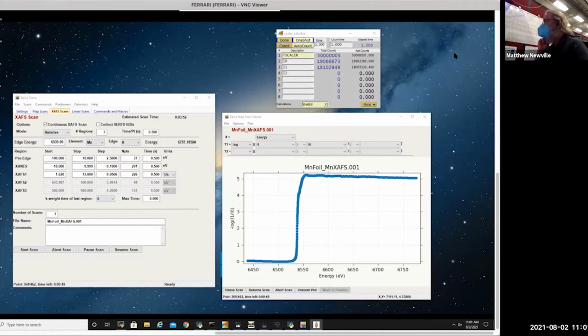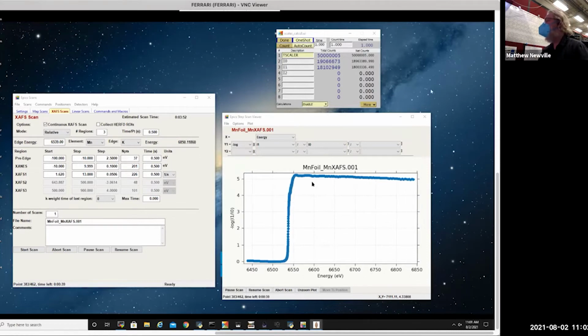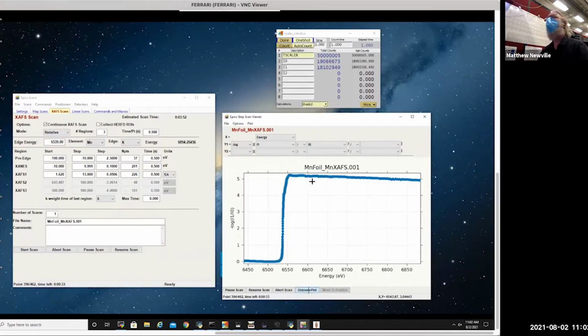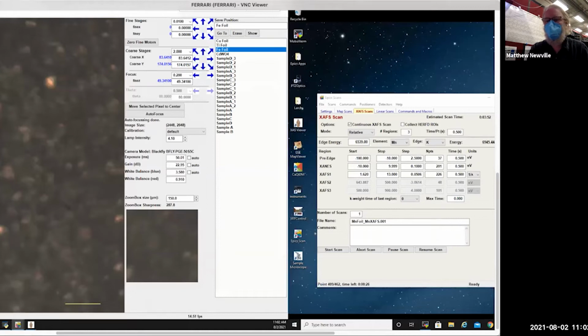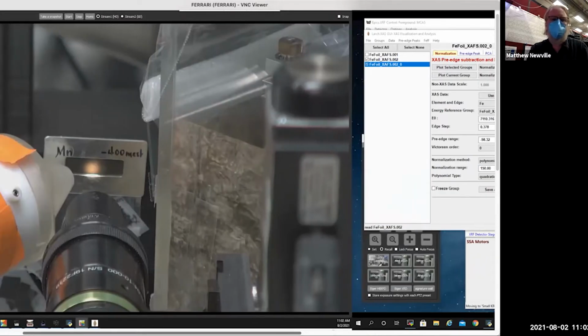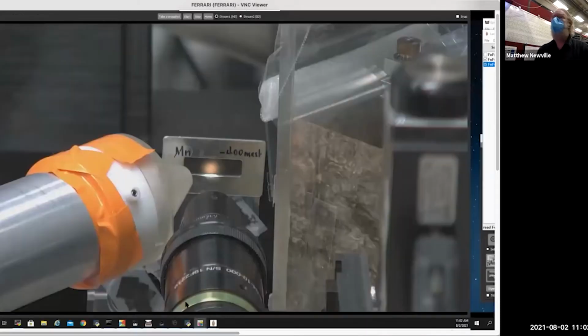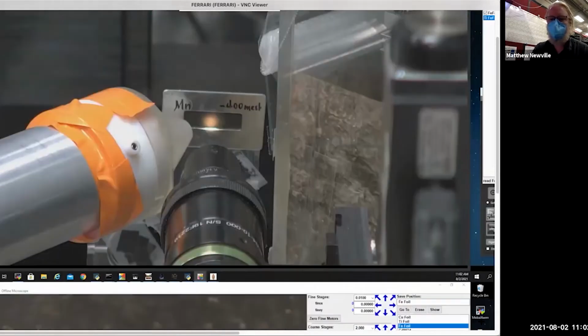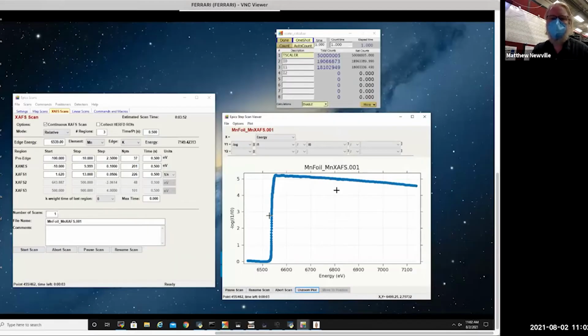Okay. So this foil, this is often what I see with this foil, is that it's not a very good sample. You will see this sample in many beam lines. It's a poorly made sample. It's a standard sample. You can buy this, and many beam lines will have this set of foils just like I have here, and the manganese one is totally junk. I'm just going to say the manganese one here is complete junk. So that didn't work at all. That's some really crappy XAFS data measured in transmission.